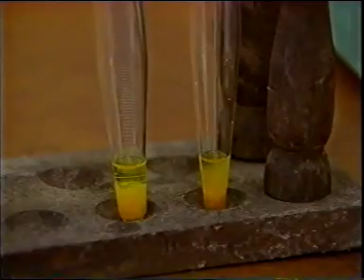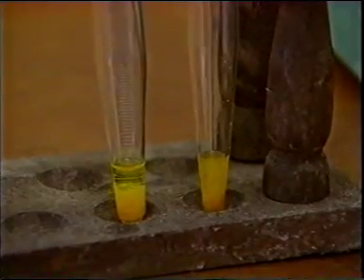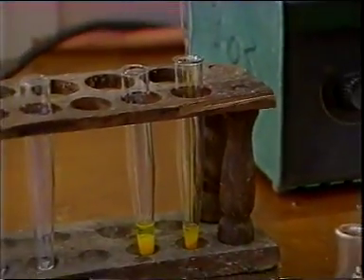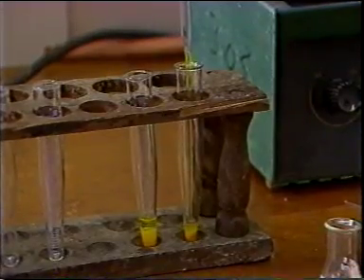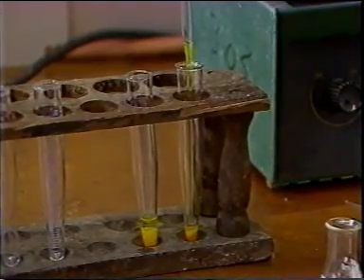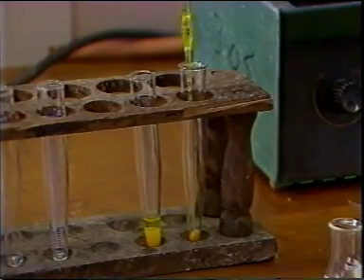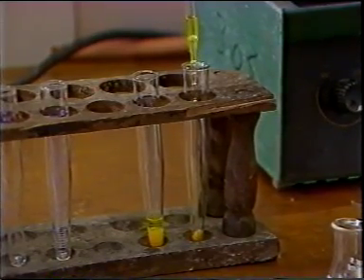By pressing the square end of the pipette hard against the bottom of the flask, the mother liquor is withdrawn, leaving the crystals behind.